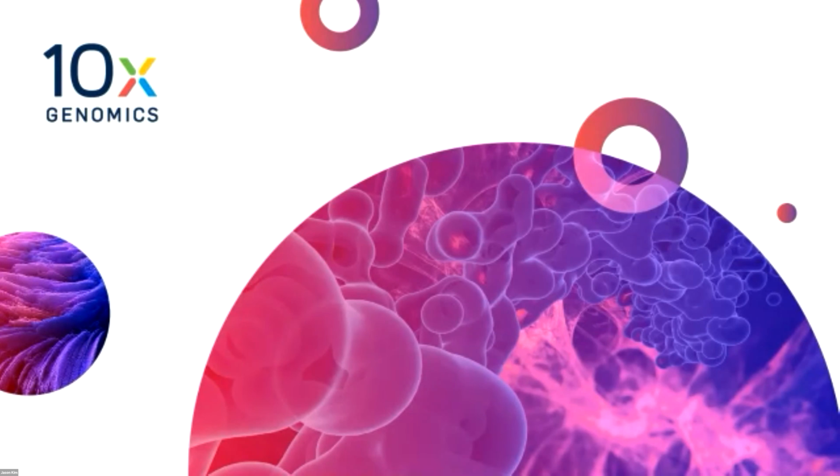To address the second part of your question, lateral diffusion: I was surprised to learn, when we purchased Spatial Transcriptomics as the company that had this, that they had about 10 papers already published in Nature and other publications that did test the lateral diffusion. That was the number one thing that I think most people were concerned with. If you permeabilize correctly, this is the reason why we have that tissue permeabilization step, you want to dial in so that you're not over permeabilizing and start getting lateral diffusion. You obliterate your cells to the point where everything's flowing all over the place.